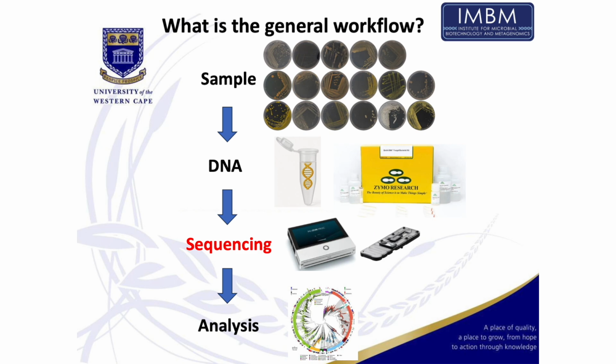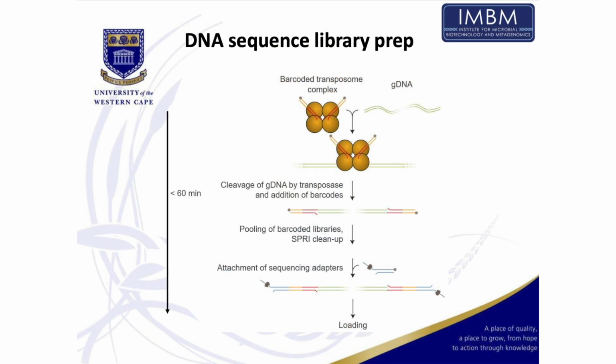Of course, you want to do the sequencing. That's what we'll do next. And then after we're done, we'll come back and I'll talk about some of the analysis. How do you deal with the data? What can you do with it? So again, this is the crash course. What are we going to do?